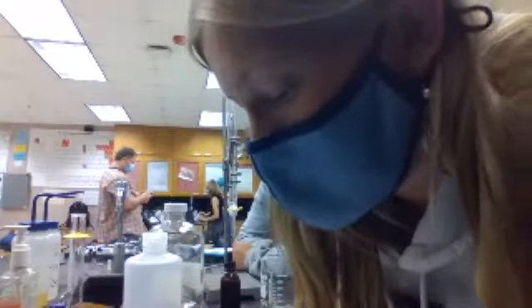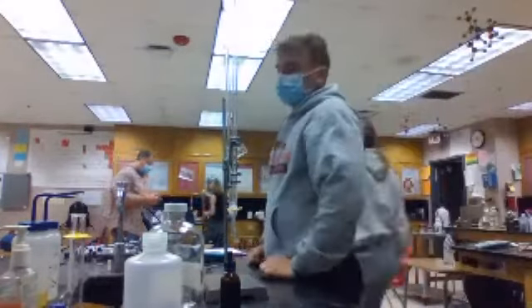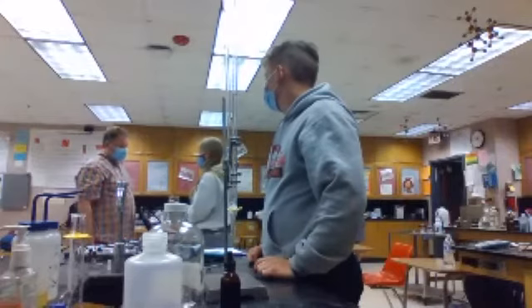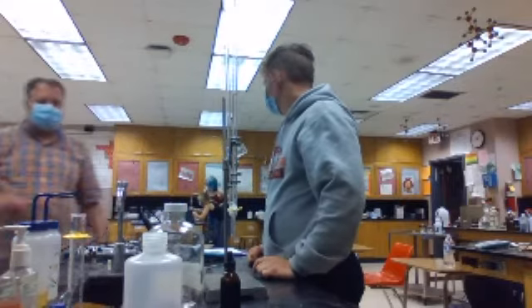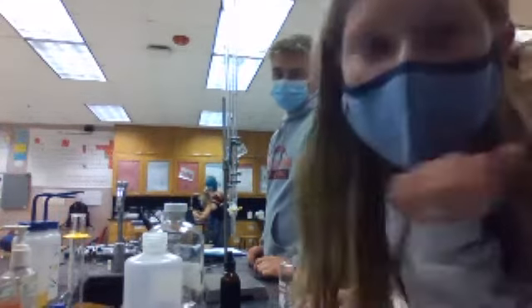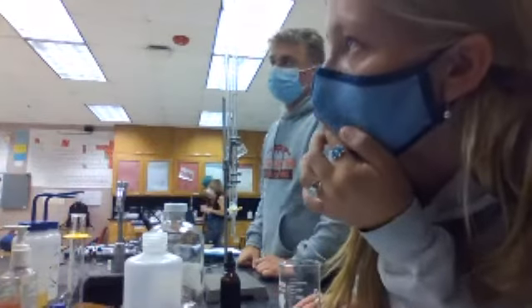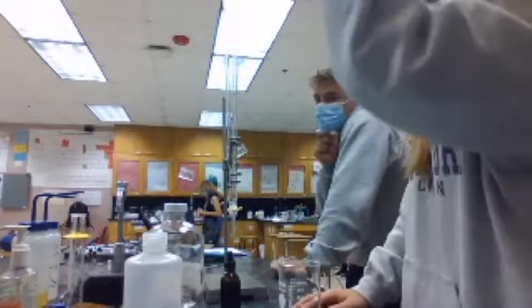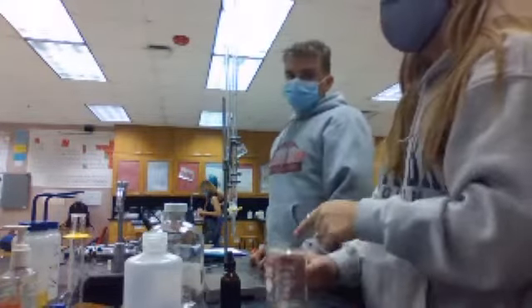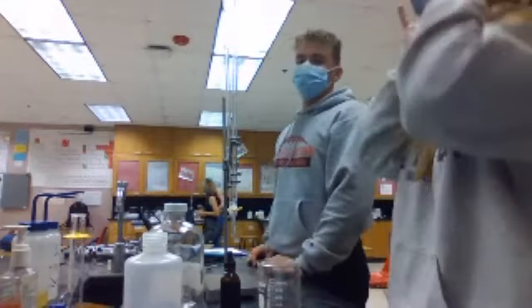At 0, it was 0.96. That's what we did before we added any base. Okay, thank you. Hold on, let me ask, because we did that without the phenolphthalein. You don't count that. It's just in there and you start adding the base. But on the graph, it's 0 milliliters. Yep. That would be considered 0 milliliters. So you can just start adding the base now.